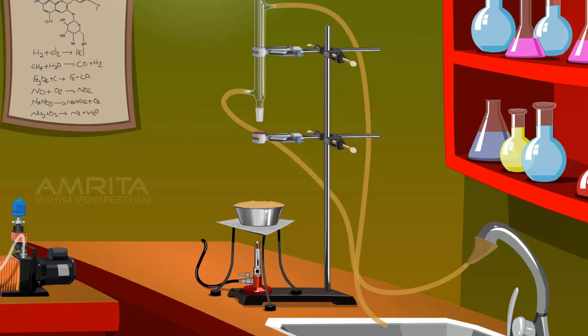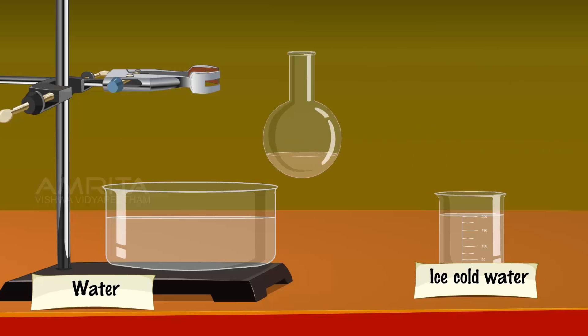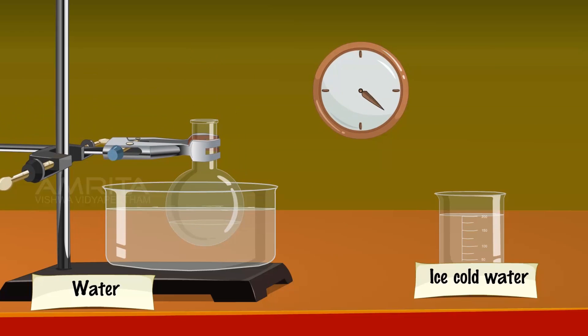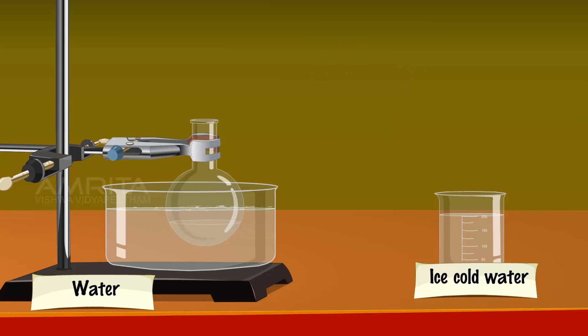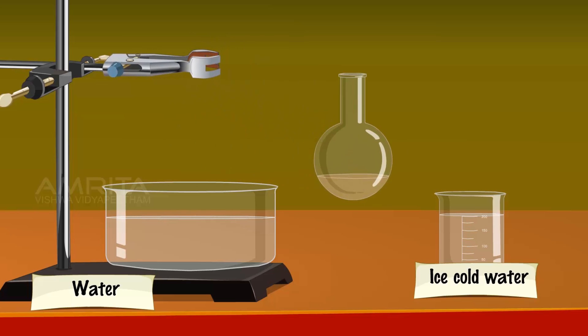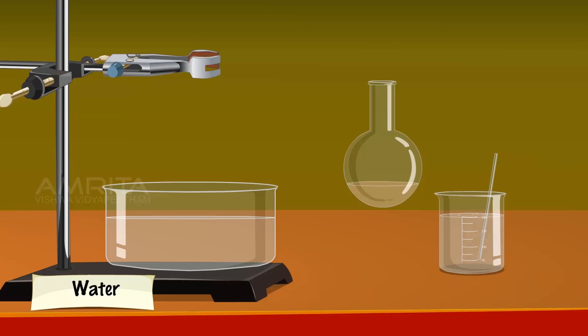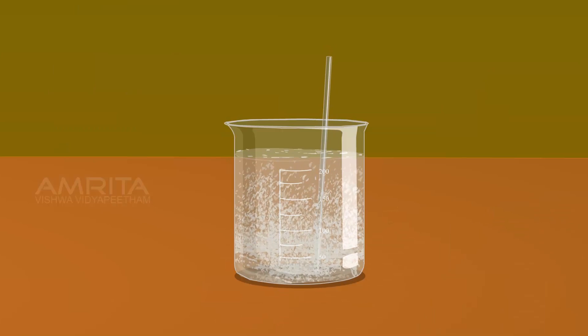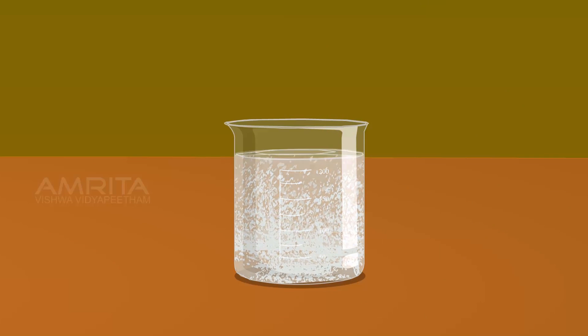Cool the mixture by placing the RB flask in a dish containing water. Pour the liquid from the RB flask slowly into a beaker containing 200 ml ice cold water. A white precipitate of acetanilide is formed.